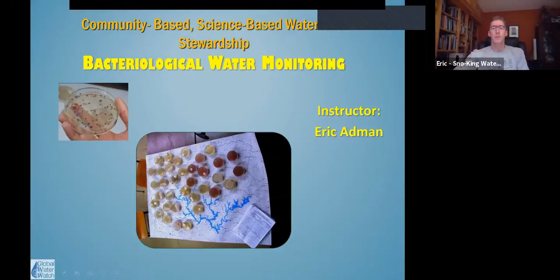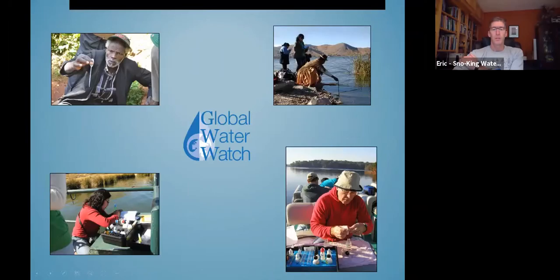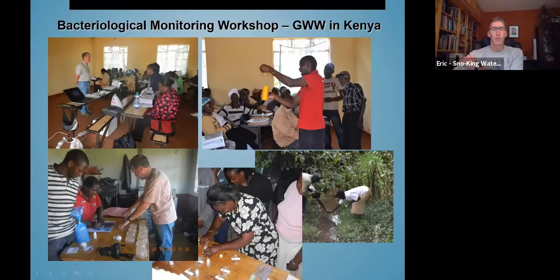Okay, so we're going to talk about bacteriological monitoring. Already kind of talked about our organization and about Global Water Watch that we're a part of. This is an example of a bacteriological monitoring workshop that Global Water Watch was doing in Kenya.